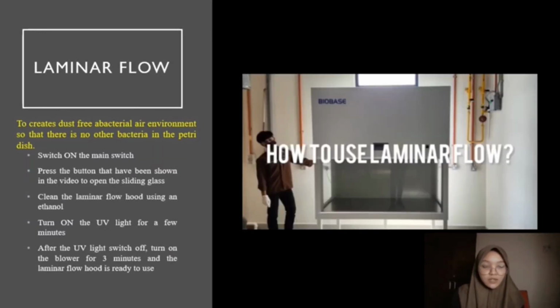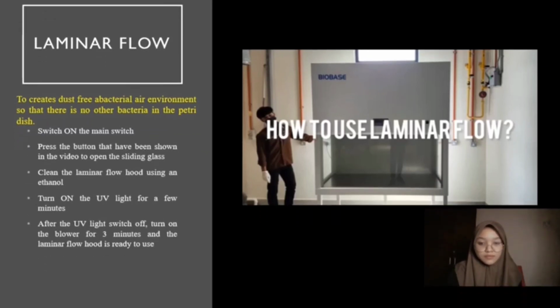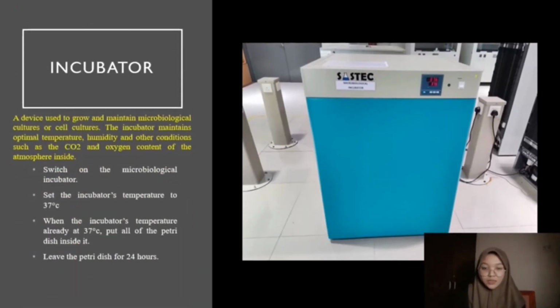Okay, so that's all for laminar flow. Next equipment, which is incubator.